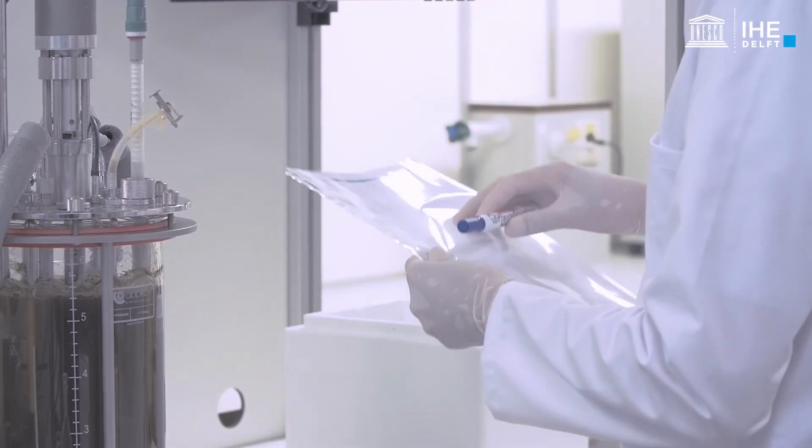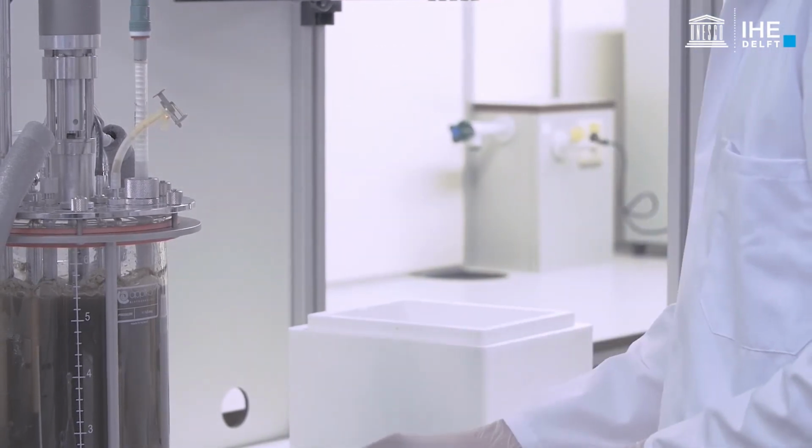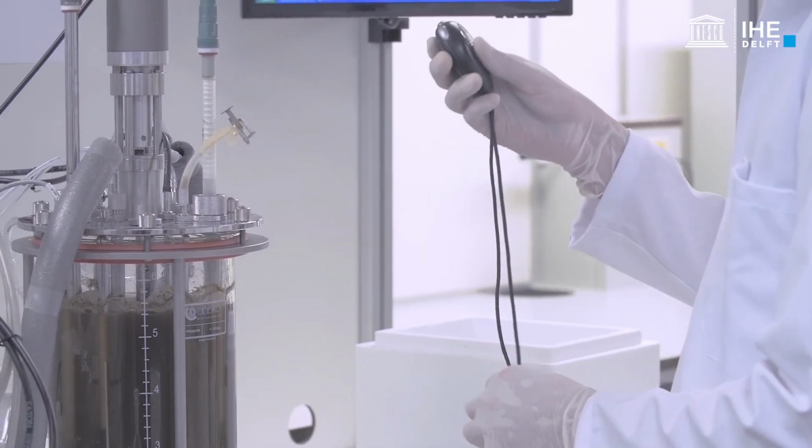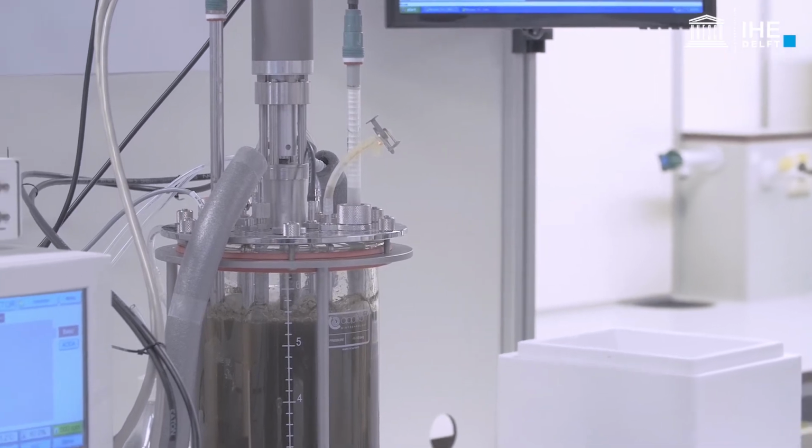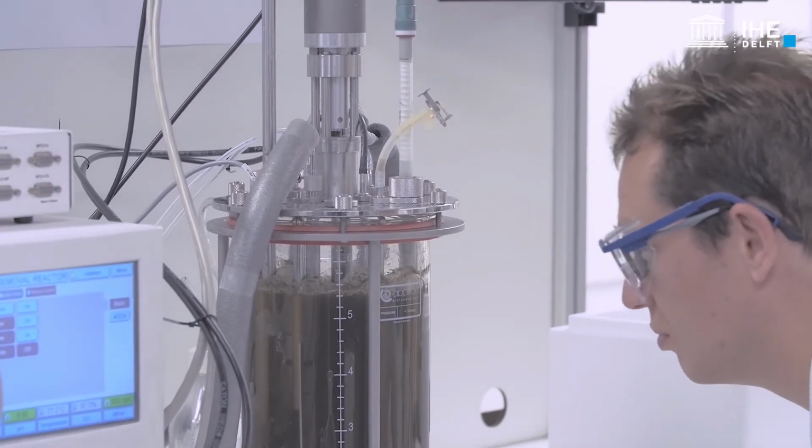Continue with the test after the acclimatization of the biomass in the reactor to the expected operating and environmental conditions and after the collection of the preliminary samples.